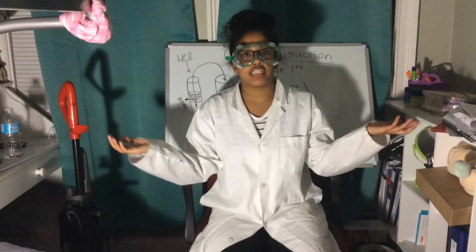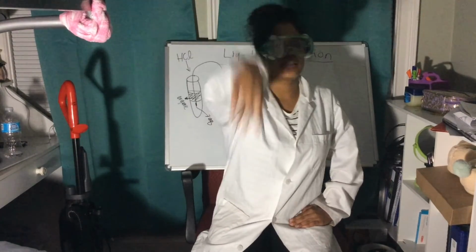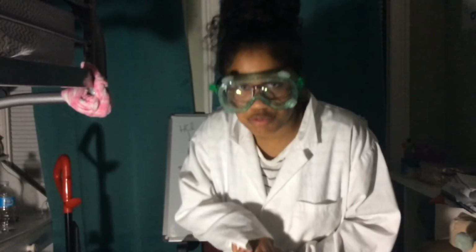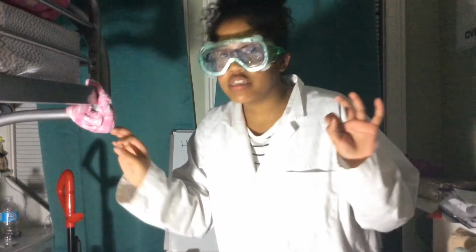But unfortunately, I did not get any crystals to collect. But that's okay. It wouldn't be lab without sources of error, right? Due to me not having any crystals, it's very probable that the organic phase was accidentally transferred into the culture tube of the aqueous solution. The free base would have been dissolved in this very small layer on the top of the culture tube, and therefore the solution would be to leave it to dry throughout the next course of the week.